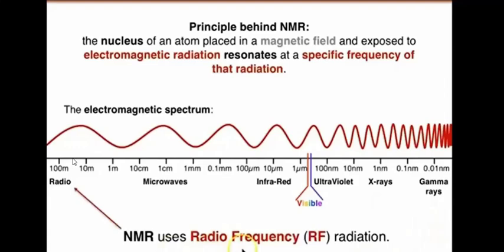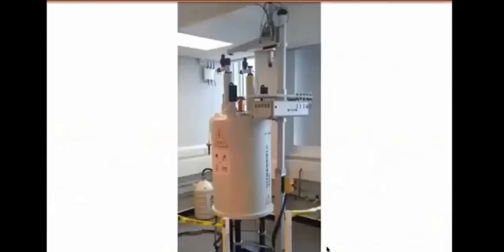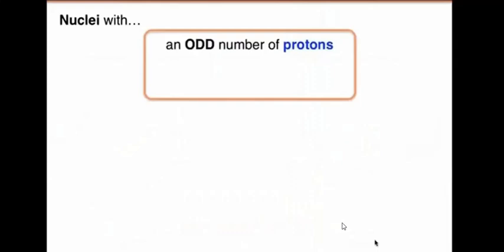We use radio frequency in these NMR spectrometers.